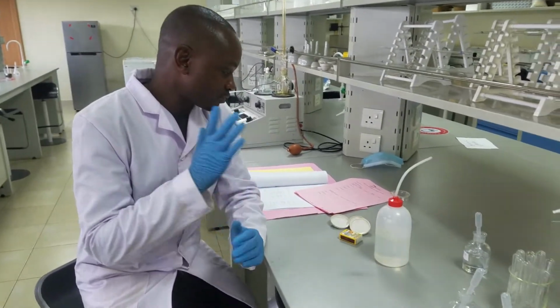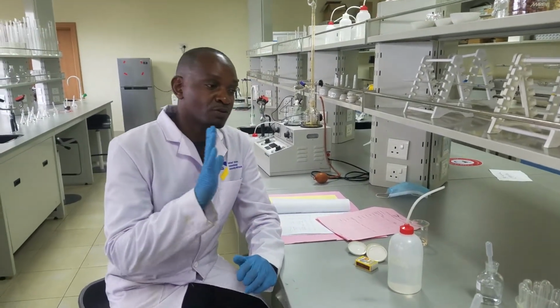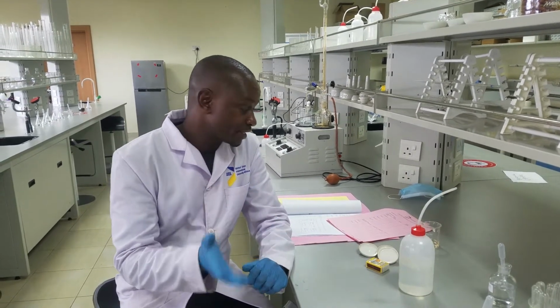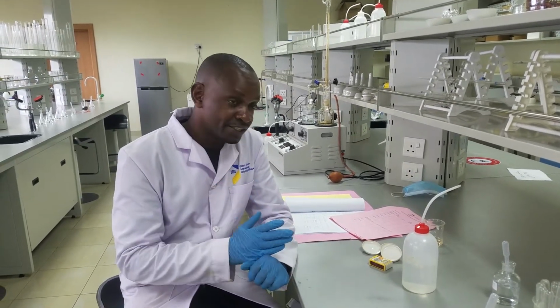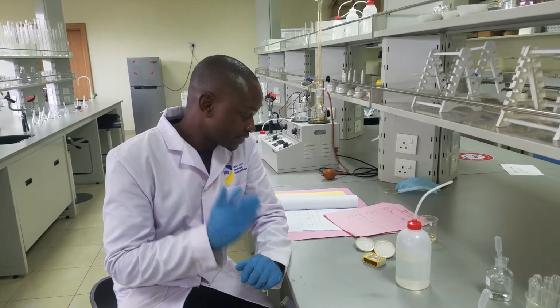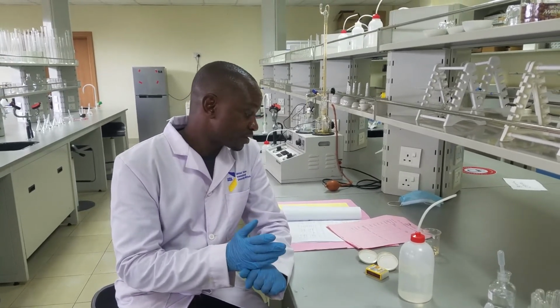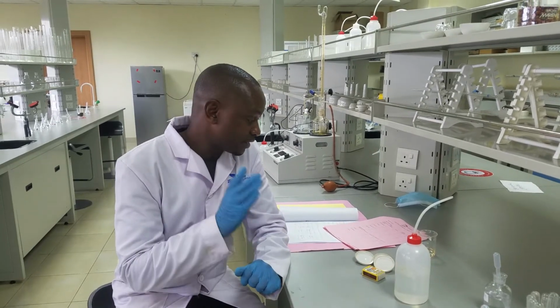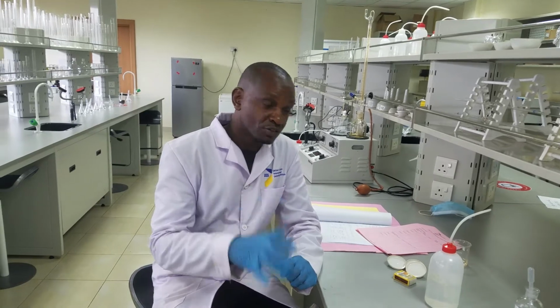So the second one we want to do, we have 4 types of reactions. One is combustion, the other one is the bromine test, the other one is the potassium permanganate test, and the sulfuric acid test. But since we don't have bromine liquid and potassium permanganate, you will do this when you resume face-to-face.